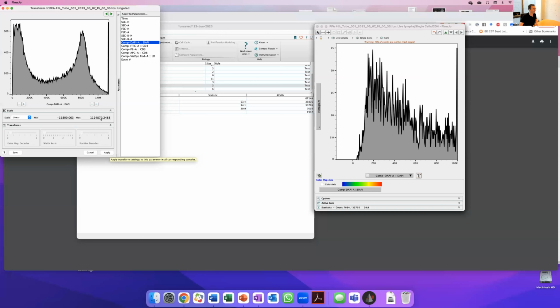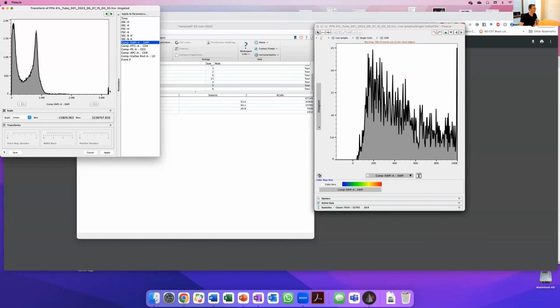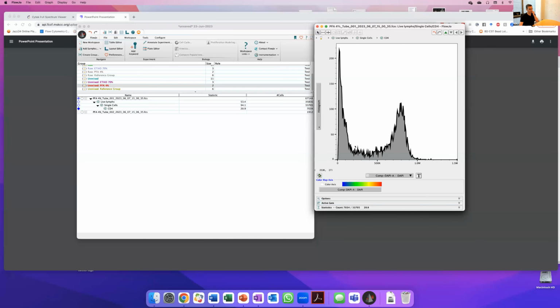So we can't really complain. But let's say I still see data squashed here. Do you see that it's approximating 4 million, and there it is. Now we're already getting things off scale, right? So we could just leave it here and then apply, and you can see that this is basically the histogram that we obtain. And now you can be asking the question, well, why do we have two peaks?